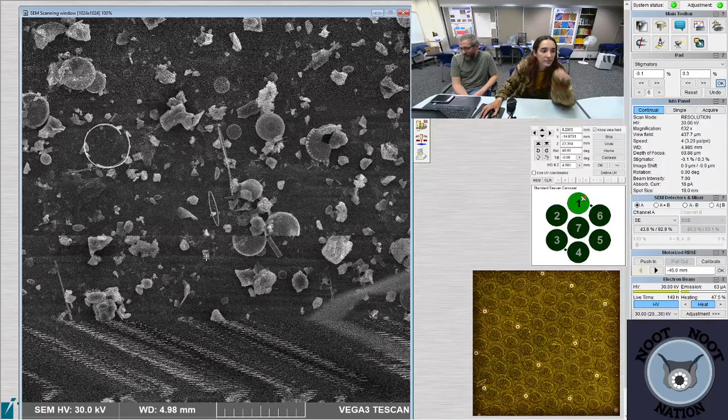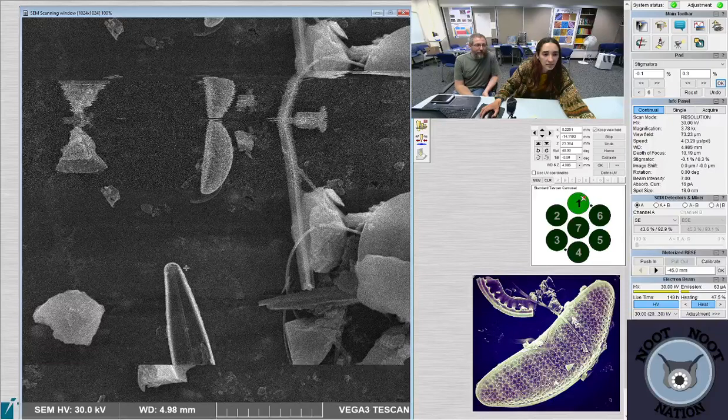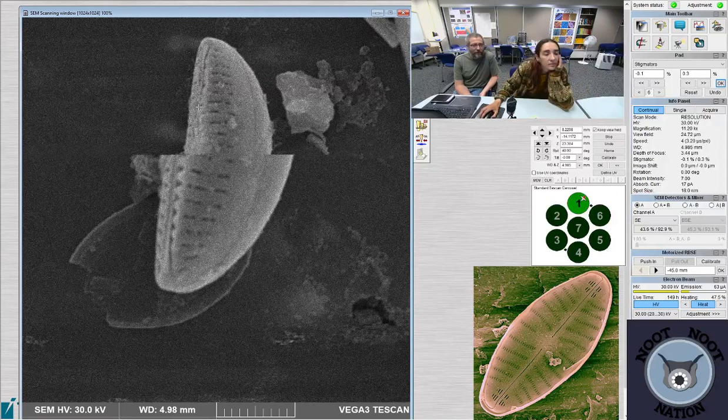Tower Mind wants to know, can we see bacteria or viruses under this microscope? Yes, but they'd be very small for viruses. They're usually right at the limit of what we could see. People ask me about the coronavirus all the time, and I would say, probably I could see it. It's a large virus, in the range of 100 to 300 nanometers, but it would just be a little blob. It wouldn't look very interesting.